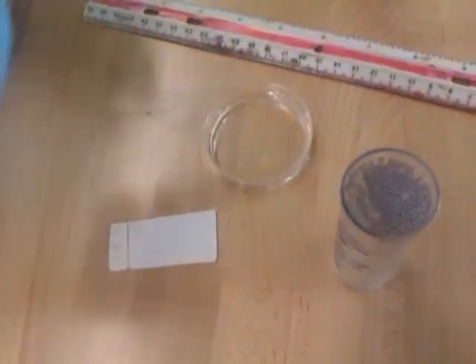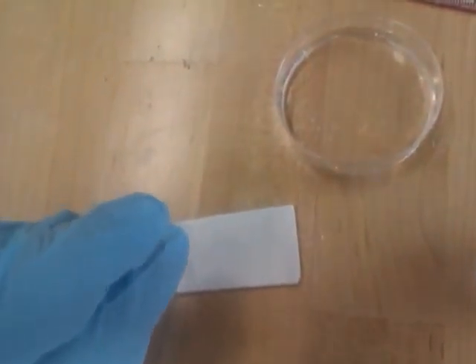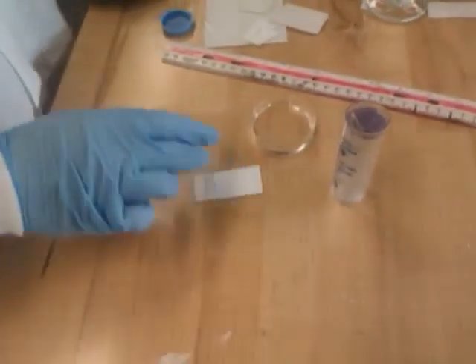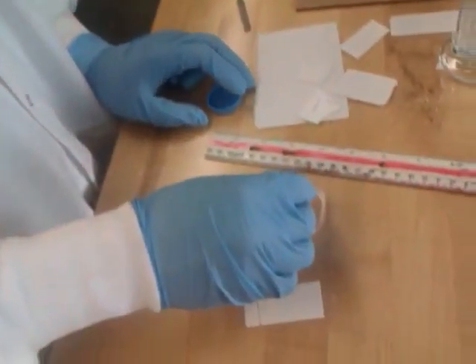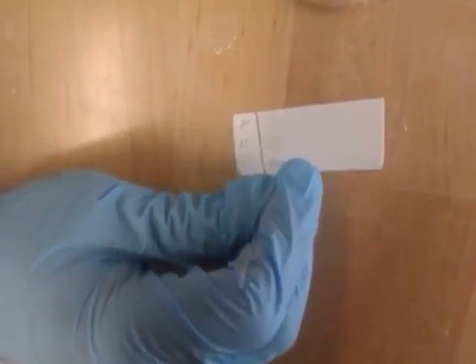Now let's spot our unknown. Get a new capillary tube, let it fill up, and make sure you don't touch the other side. Keep it there. Now let's do our last solution, our water. We need another capillary tube. Spot it, spot it, spot it.